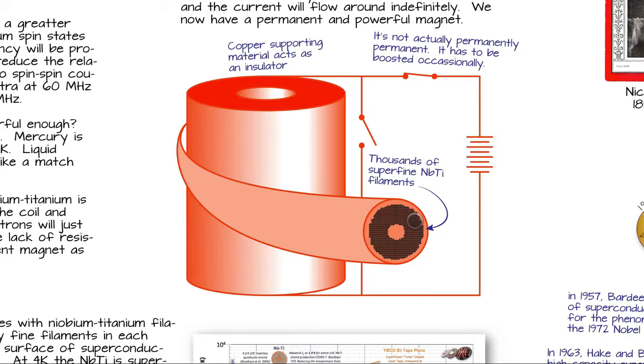Now, if your magnet should ever warm up, and these lose their superconducting power, what would happen to all that current that's flying around inside your magnet? Well, it could then start traveling through the copper, which will release a lot of heat, but at least it won't explode from all those electrons stopping instantly. They'll heat up the copper and come to a stop.